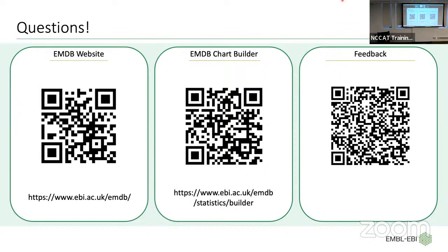I think if there was something along those lines, or examples that people could look at, because each of these programs only writes a certain type of file for the most part. All of this metadata could be captured, but there are activation barriers from users who already don't want to do this because of how many files there are. And if it's optional and they don't know what it is, they're going to skip it. They're not going to figure out what it is.